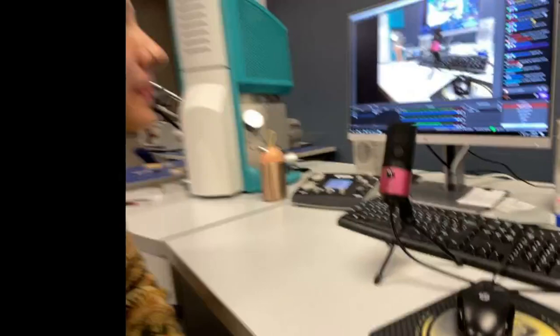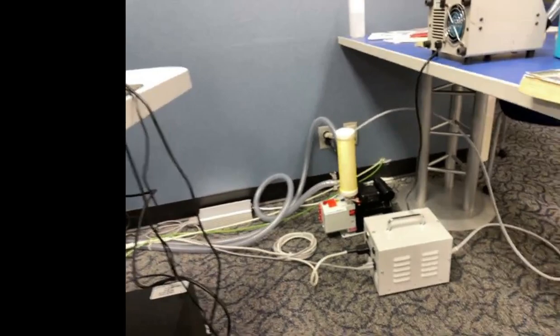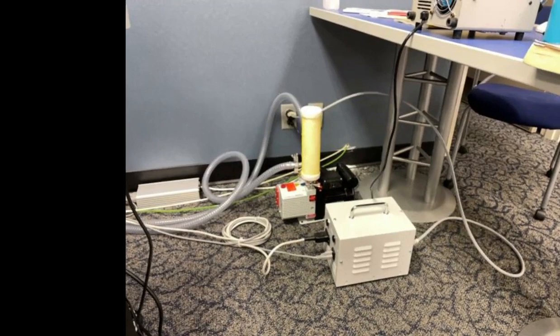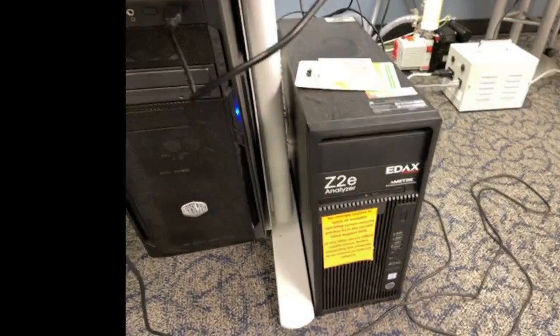See? There's Laura. The buzzing noise is coming from this thing right here, which is the pump. It pumps the air out of the chamber, so it's always running while the machine is running. That's the computer that's running the scanning electron microscope right there. That one over there runs the EDAX, which is the elemental analyzer.